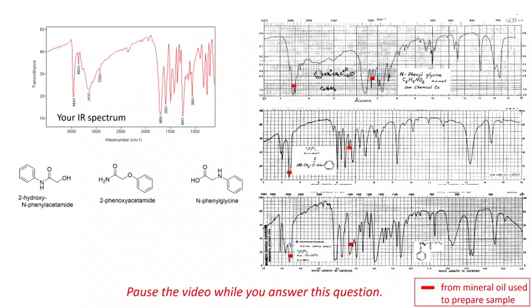And then the ones below it have an even scale on the bottom, but it's not inverse centimeters. It's microns. Those are wavelengths instead of frequency. And I would just say, don't worry. So the challenge here is actually to match the spectra, even though it's not an exact match in terms of spacing of the lines. So it is a good challenge. Take a crack at it, see if you can figure it out, and get back to me.